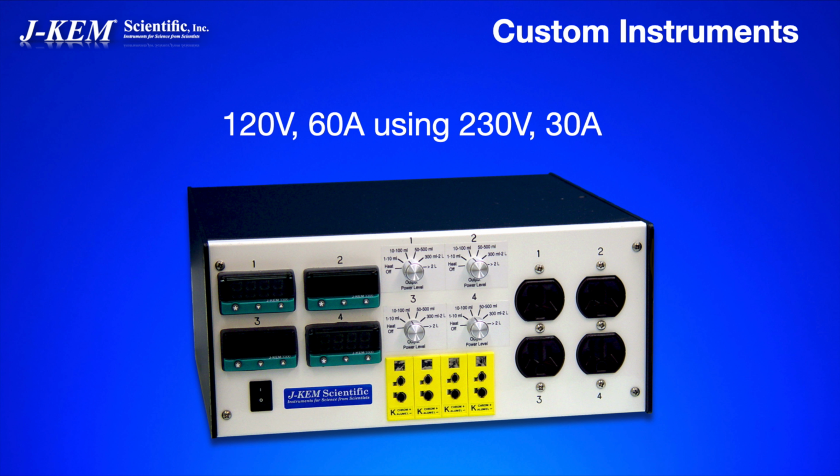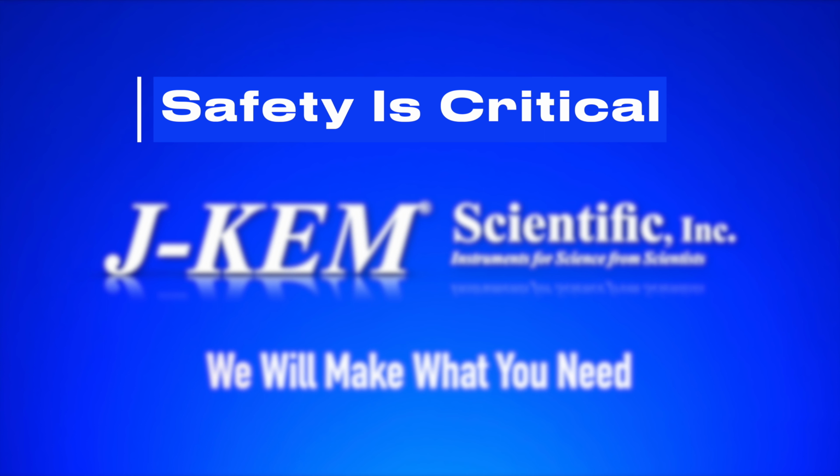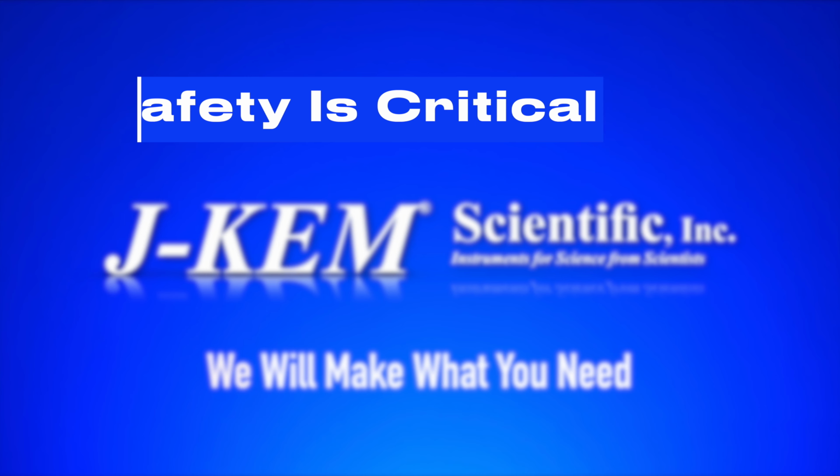Often we have customers who have really very high power heaters. We shipped a controller within the last month that was 208 volt output, 3-phase current, 80 amps, 22,000 watts. And what's important about these custom controllers, when you come to that wattage, when you're going to put a temperature controller on a heater with that much power, you need safety. That controller was NRTL approved. That controller had both a primary and a secondary backup. That controller was built with 20 years of experience. When you are going to put that kind of power into a heater, that's what you need.